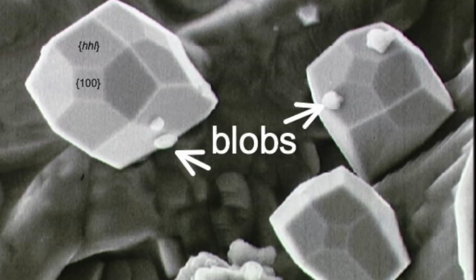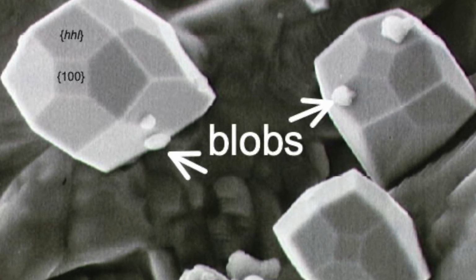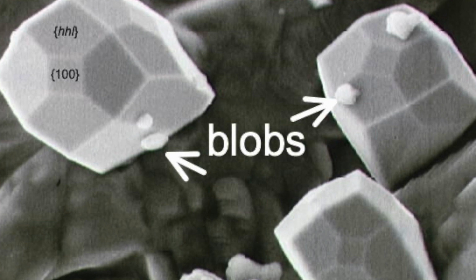And by also analysing crystals which weren't perfect, which had different sizes, one crystal had one particularly large facet, a 001 facet, for example, we could again reproduce what the images would look like. One or two crystals had clearly other crystals attached to them as well, or blobs. Right, blobs. They look like blobs. Yeah.